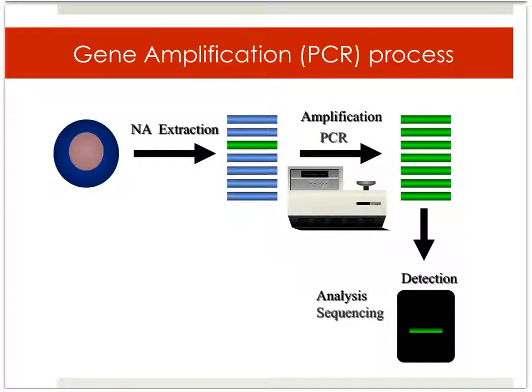Okay, what do we mean by gene amplification? Again, very quickly, we learn it from each other. You extract nucleic acid material. In many cases, by the way, there are some genotyping methods where you don't start by extraction. And I'm sure Riley will cover this afternoon. If you do, for example, pulsed-field gel electrophoresis, the first step is not extraction. You can start from the bacterial cell. But in classical, typical molecular methods and genotyping methods, the first step is extraction. You extracted already. We discussed in the last 5 minutes.